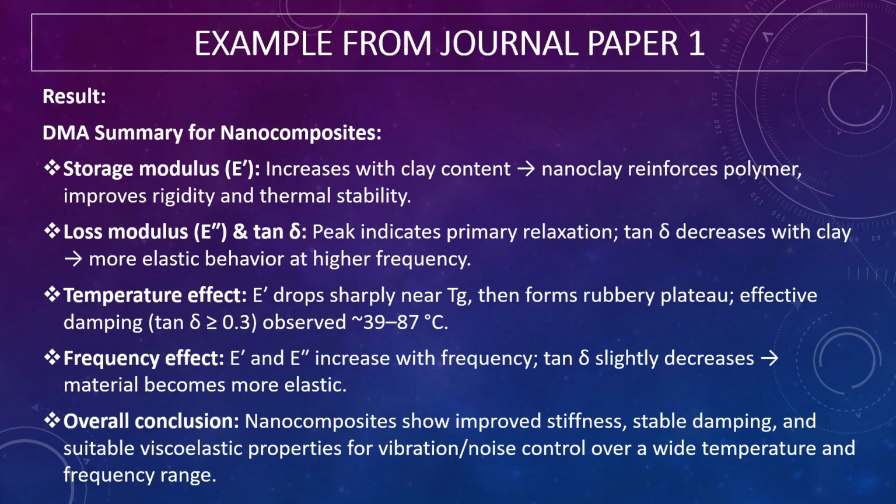For the summary of the results, the storage modulus increases with clay content, which means nanoclay reinforces the polymer and improves rigidity and thermal stability. Loss modulus and tangent delta peak indicate primary relaxation. Tangent delta decreases with clay, showing more elastic behavior at higher frequency.